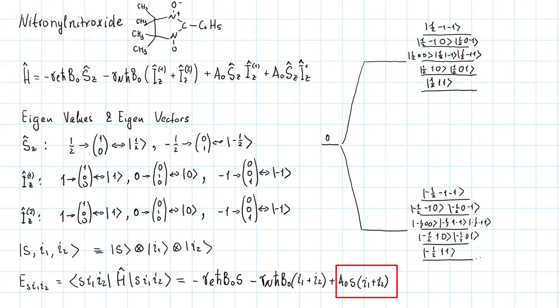In the case of S equal to minus 1/2, the 5 corresponding energy levels will be moved together, and in the case of S equal to 1/2, the 5 corresponding energy levels will be moved apart.